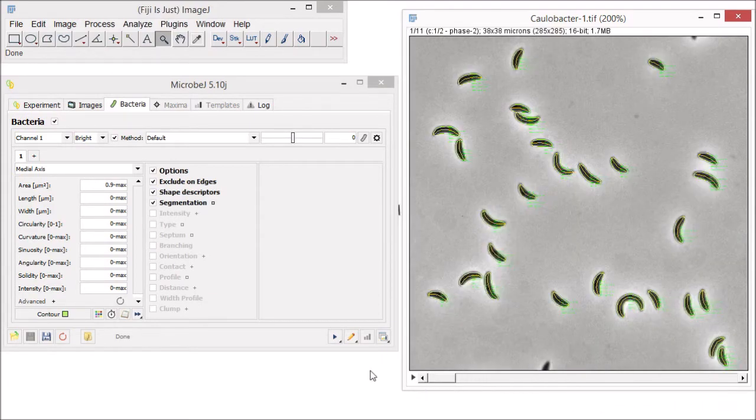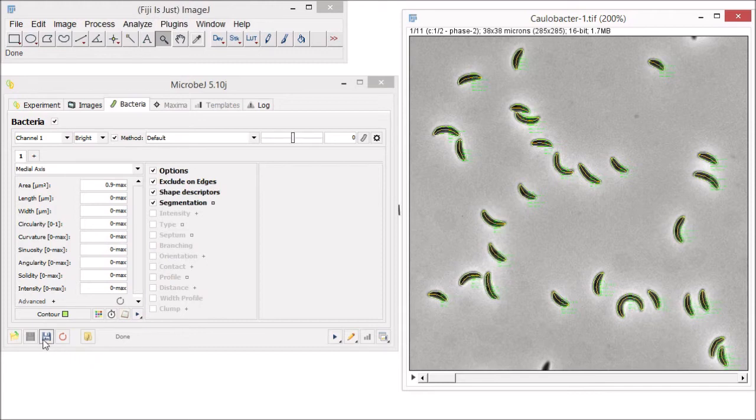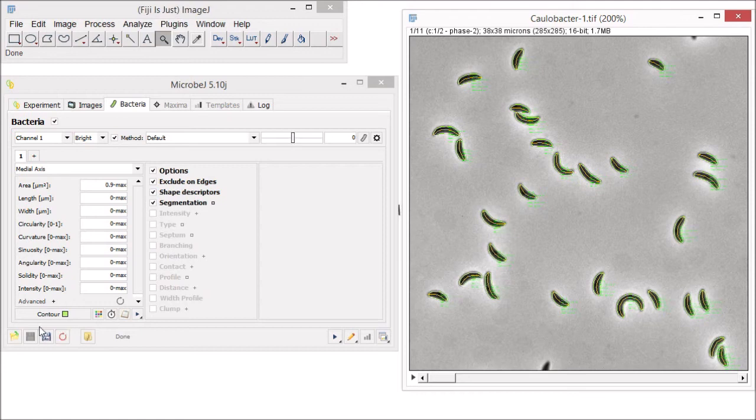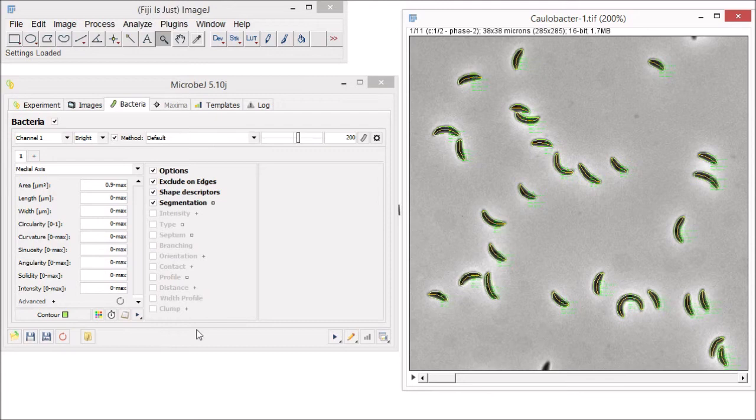If you will be analyzing images of similar types of bacteria in the future, it might be useful to reuse these settings. To do that, you want to save these settings into a file. At any time, you can save these settings as an XML file by clicking on the Save As button. You can also load existing settings by clicking on the Open button or simply drag and drop the file on the MicrobJ status bar. Note that you can also drag and drop images, templates, experiments, and result files here.